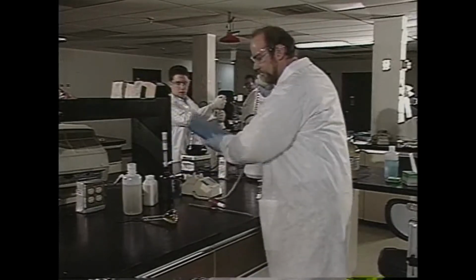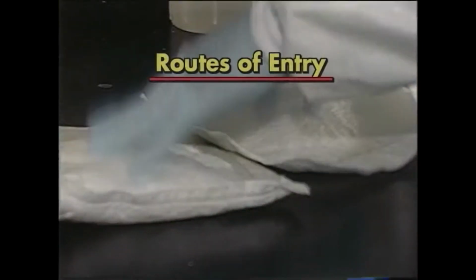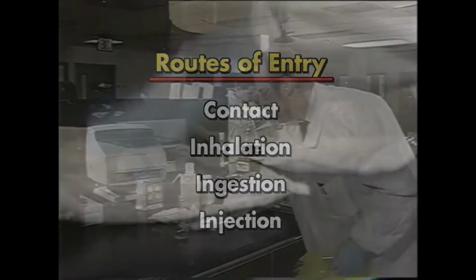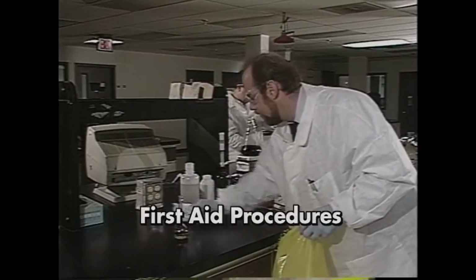Sometimes a chemical spill leads to an exposure situation. There are 4 basic routes of entry, or ways a chemical can get into the body: contact with the skin or eyes, inhalation, ingestion, and injection. Let's look at first aid procedures for each type of exposure.